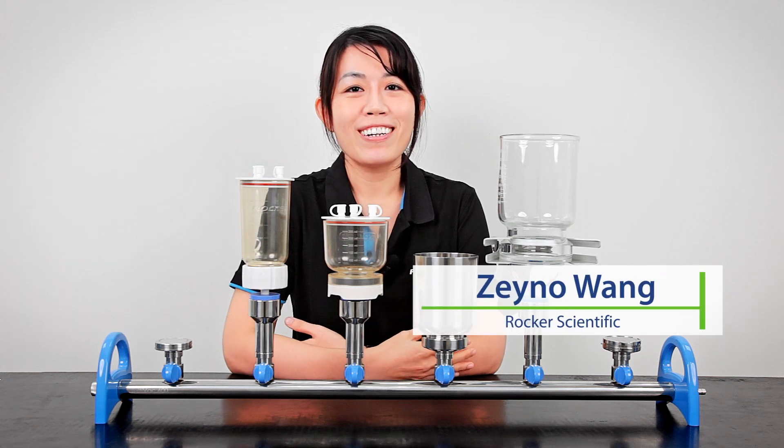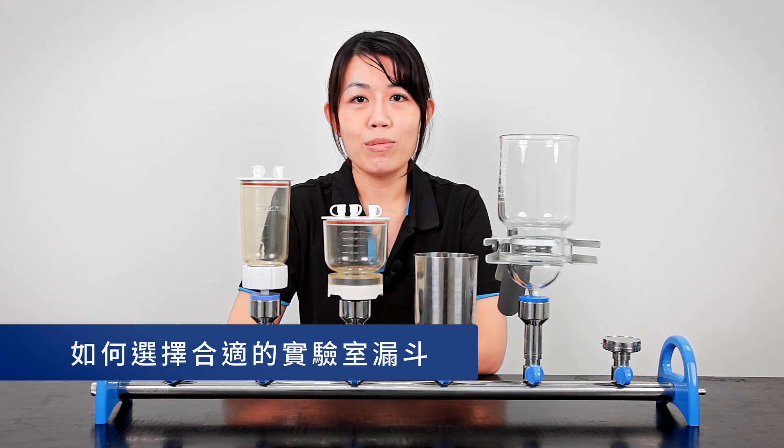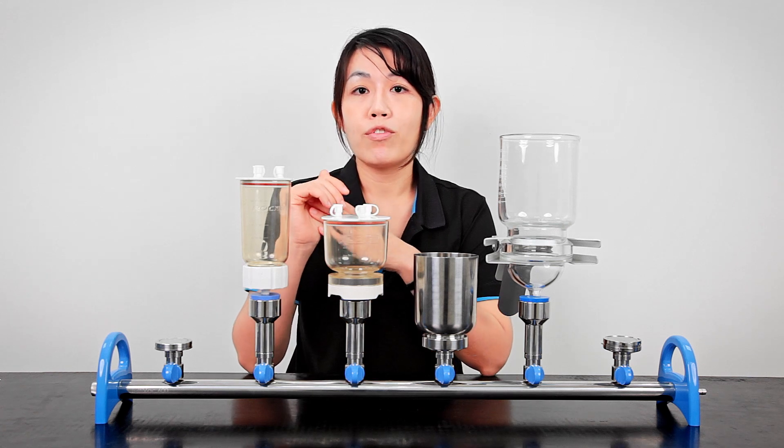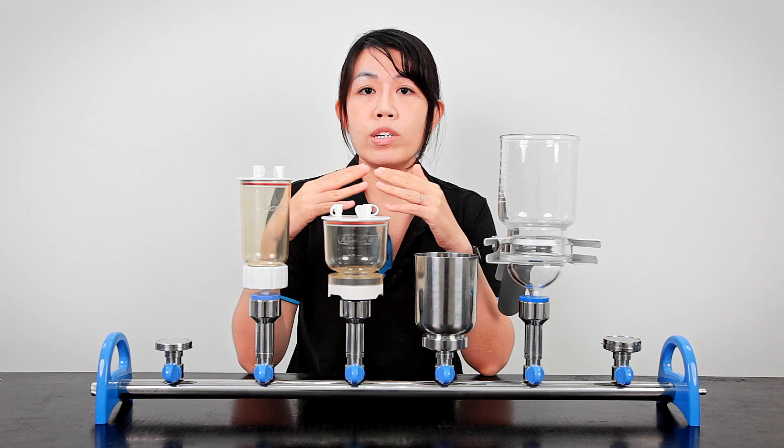Hi, this is Zeyno from Rocker. In this video, we're going to talk about how to select a suitable filter holder and funnels for your laboratory. Filter holders may vary in their sizes and materials, and in Rocker we have four different collections.